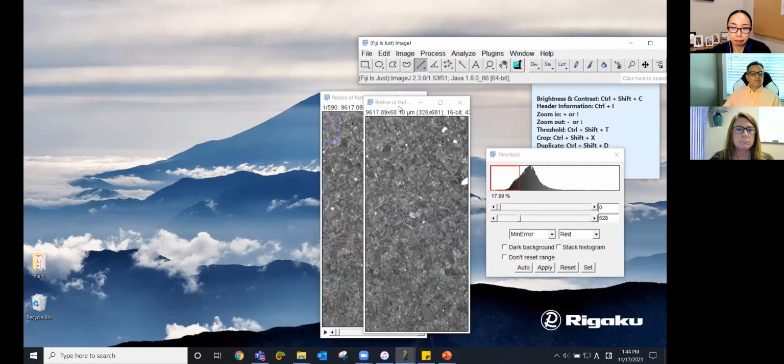So it wouldn't make sense if there was a CT-oriented version of it. And if there are people working on it, I would say please use a GPU more if you're going to do CT image analysis. There are some plugins that will let you utilize a GPU more inside of ImageJ, but what you can do with those tools is still limited.